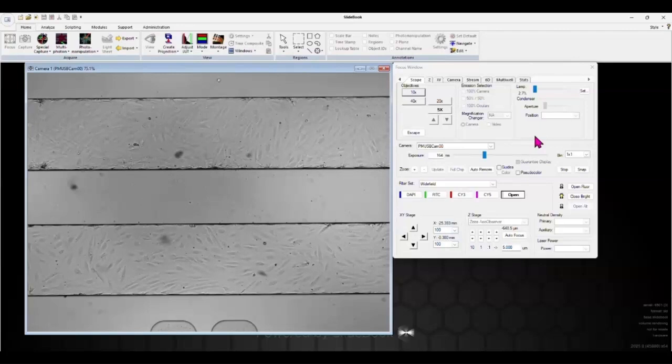So here we see the Jurkat cells flowing through the channels, and you can already spot some of them sticking to the bottom channel. These appear as small, round, darker dots. We're now going to switch to fluorescence using the DAPI channel, so you can see the cells flow more clearly.